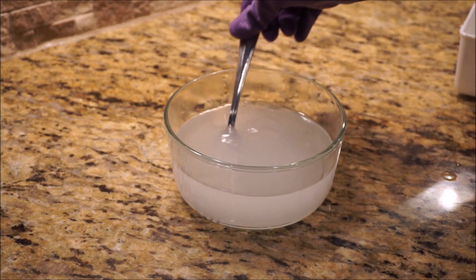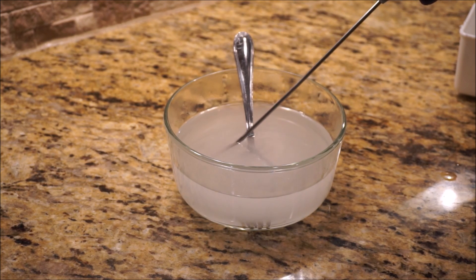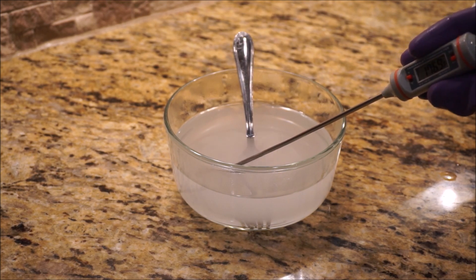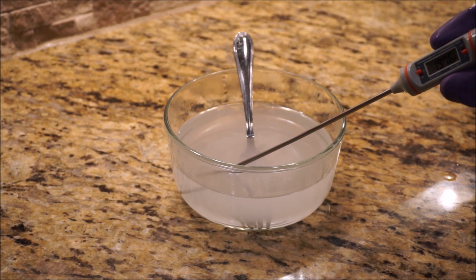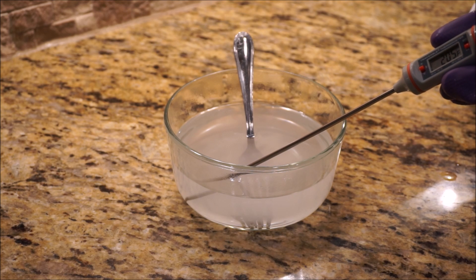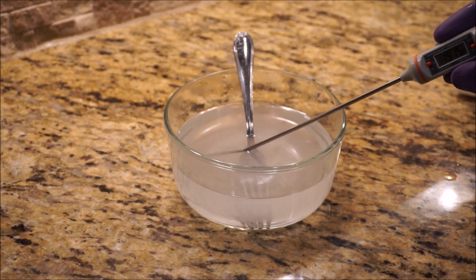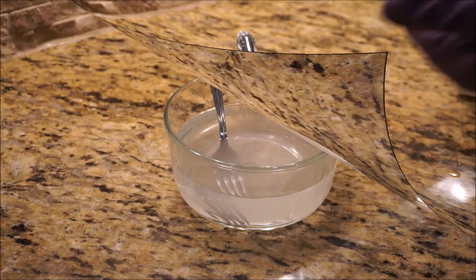This was just room temperature water before. Let's see what the temperature is now — 205 degrees. That's essentially boiling; boiling is 212 degrees Fahrenheit. So just by pouring in the potassium hydroxide to the water, it's now at boiling temperature.